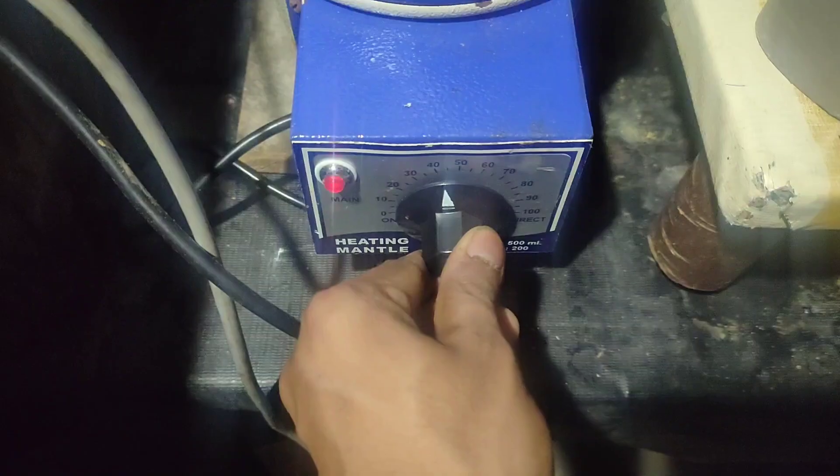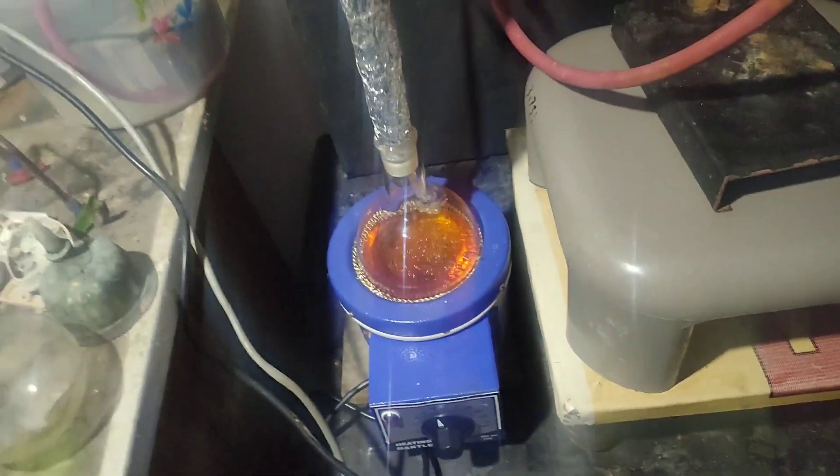The temperature went to 85 degree celsius and then it started coming down below 60. So I again increased the temperature of heating mantle and changed the receiver flask.